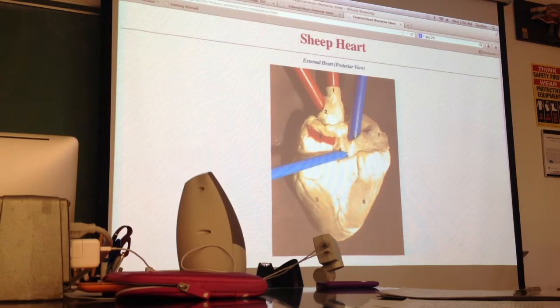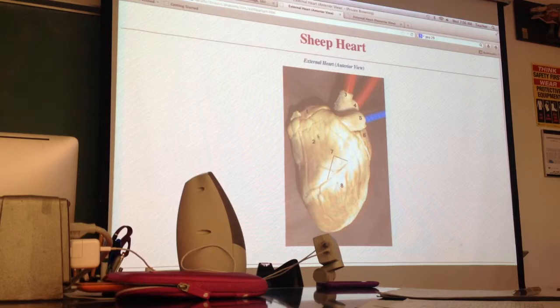All right, now for the auricles, looking at the anterior side of the heart, there's one right here that sits just on top and one that sits kind of on the side. This is our right auricle. This is the left auricle. They kind of look like salami. Just saying. All right, so that's how you'll be able to see them. They're kind of a darker, meaty color, and they have white specks in them, just like salami.